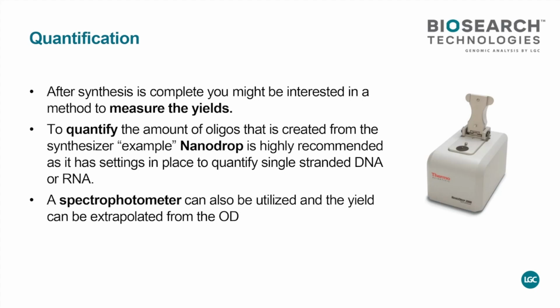fluorophore as well. So after you quantify, you know, okay, I have that many micromoles, nanograms, milligrams, ODs in my solution from one column of synthesis. What you do after that, you want to either purify it, analyze it, or just go ahead, precipitate it, and use it, especially for the primers. Just do a quick dissolve step.